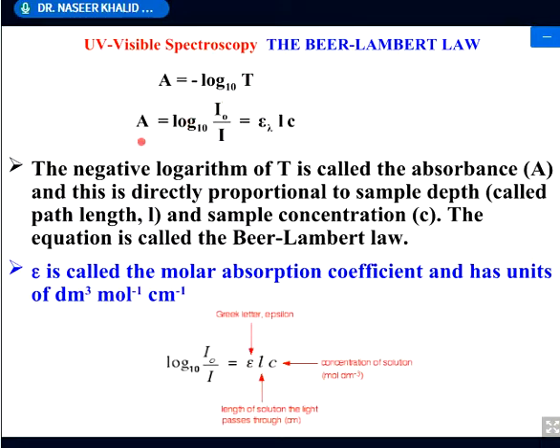Okay. Now, absorbance is equal to log I naught over I, that is equal to epsilon lambda, where epsilon is the absorptivity at the wavelength which has the maximum absorption, lambda max, multiplied by the length of the cell, and the concentration. So this is epsilon LC.